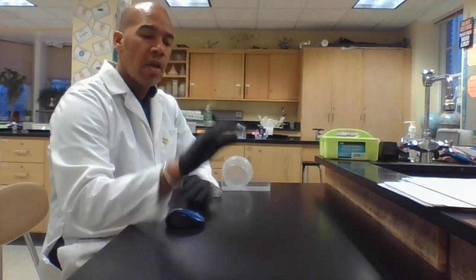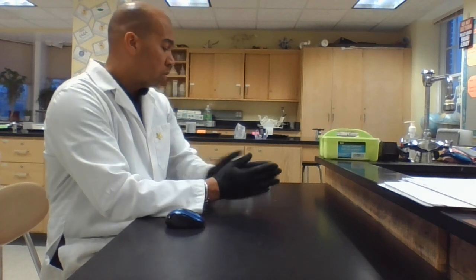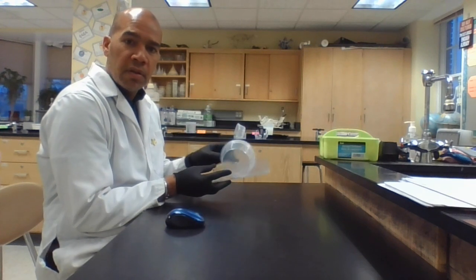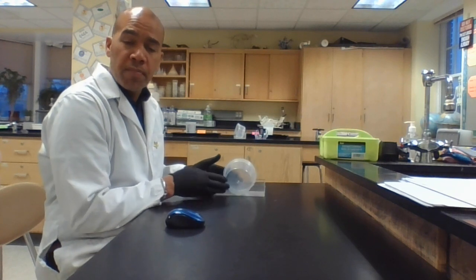Today we're going to do a lab simulation of what tends to go on in the small intestine with molecules of food that are getting digested, and how the size of the molecules affects their ability to go from the small intestine into the bloodstream. Okay? So today at your table, you'll have a little clear bin with another bin that you've seen before in another lab that we've used. This is what you're going to start with, and I'll see you in a second over at the lab counter behind us to see what we do next.